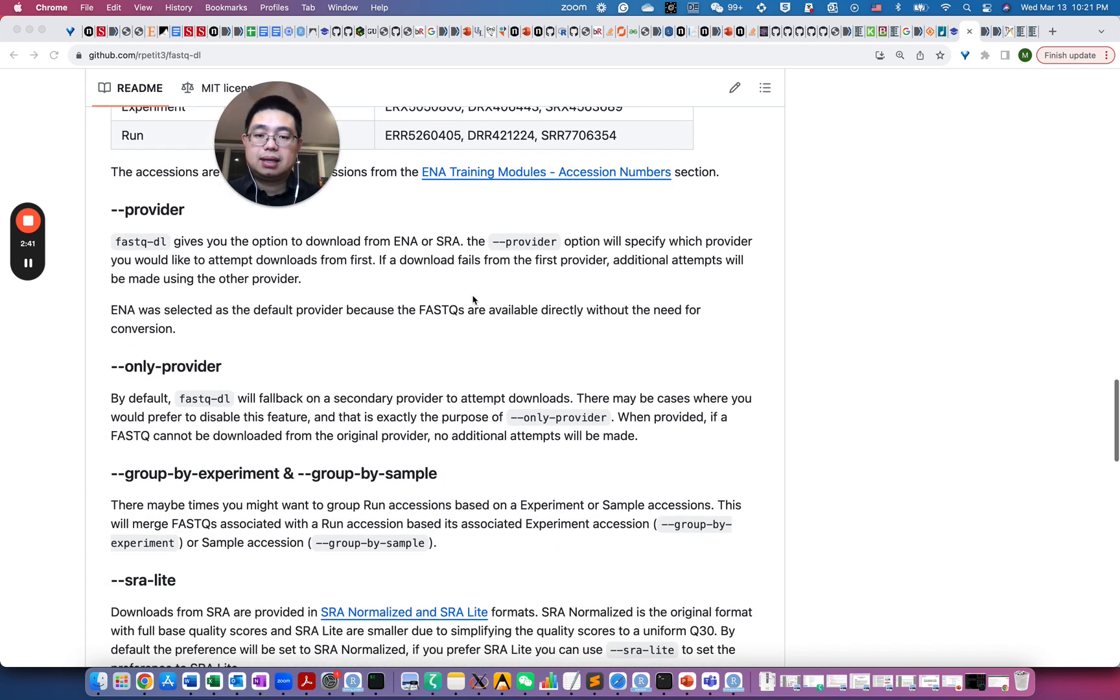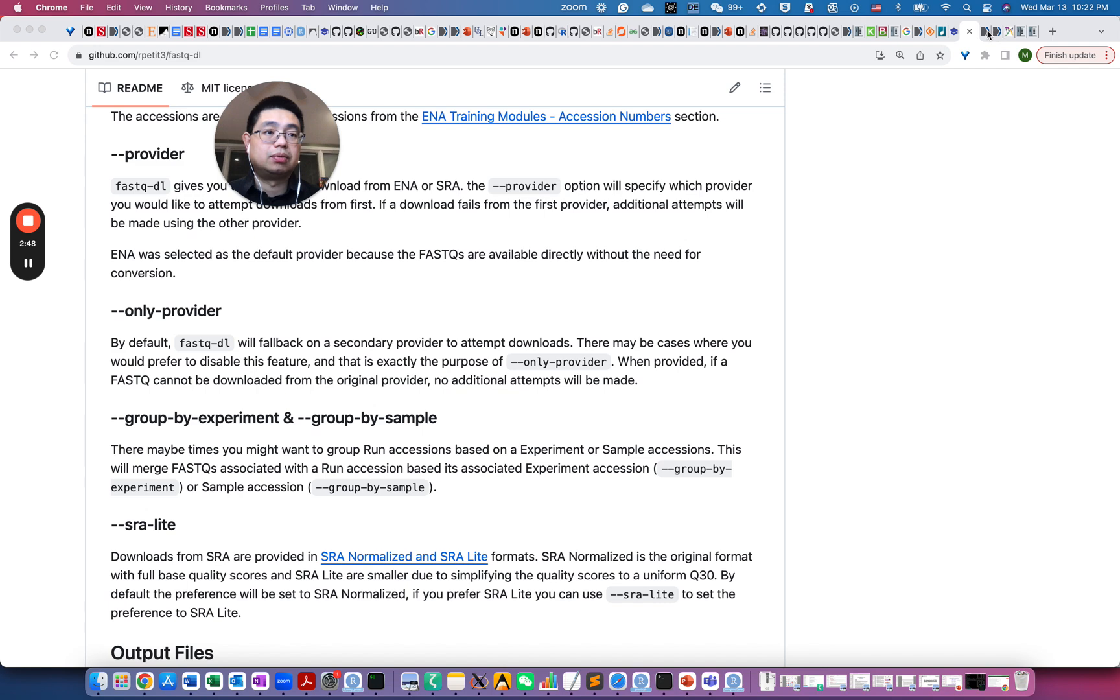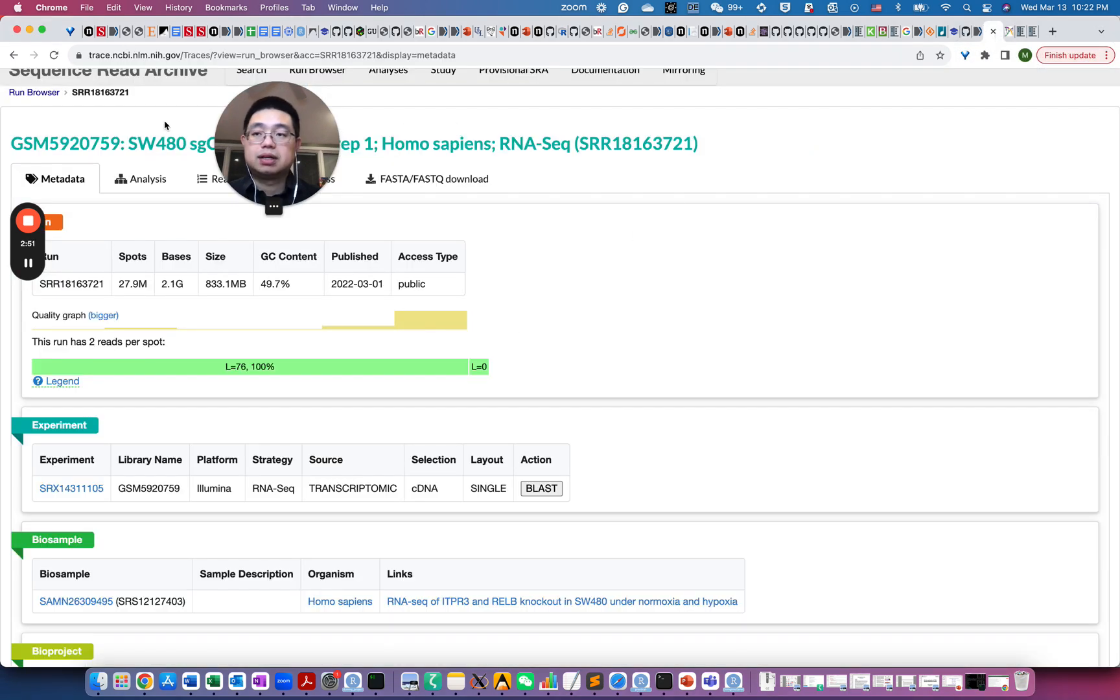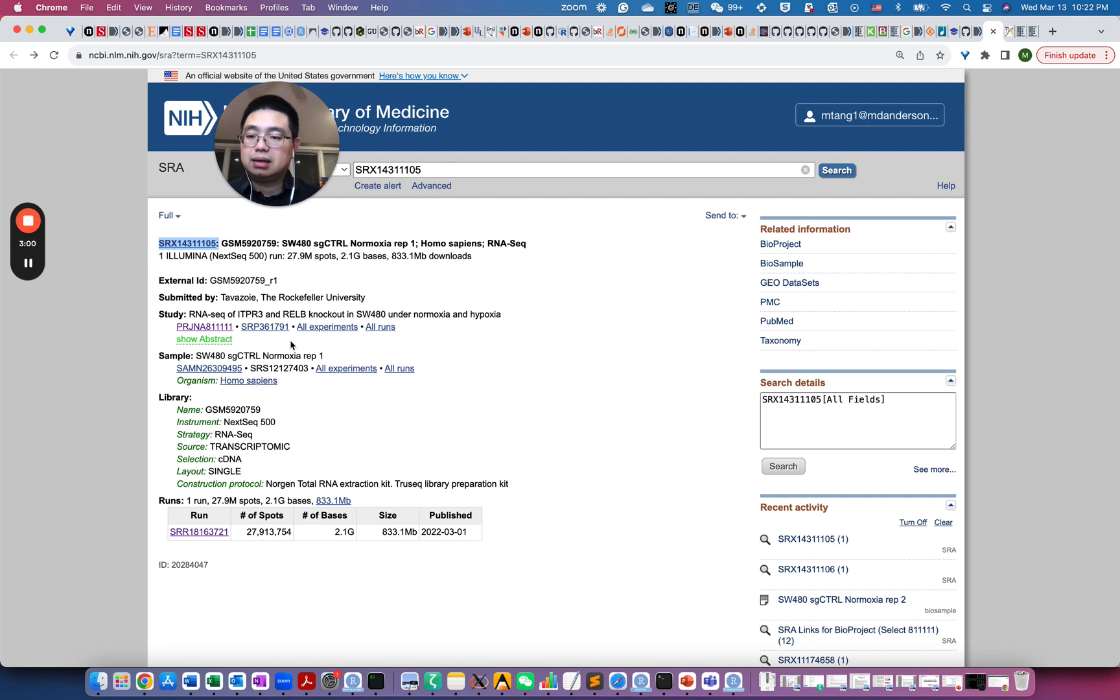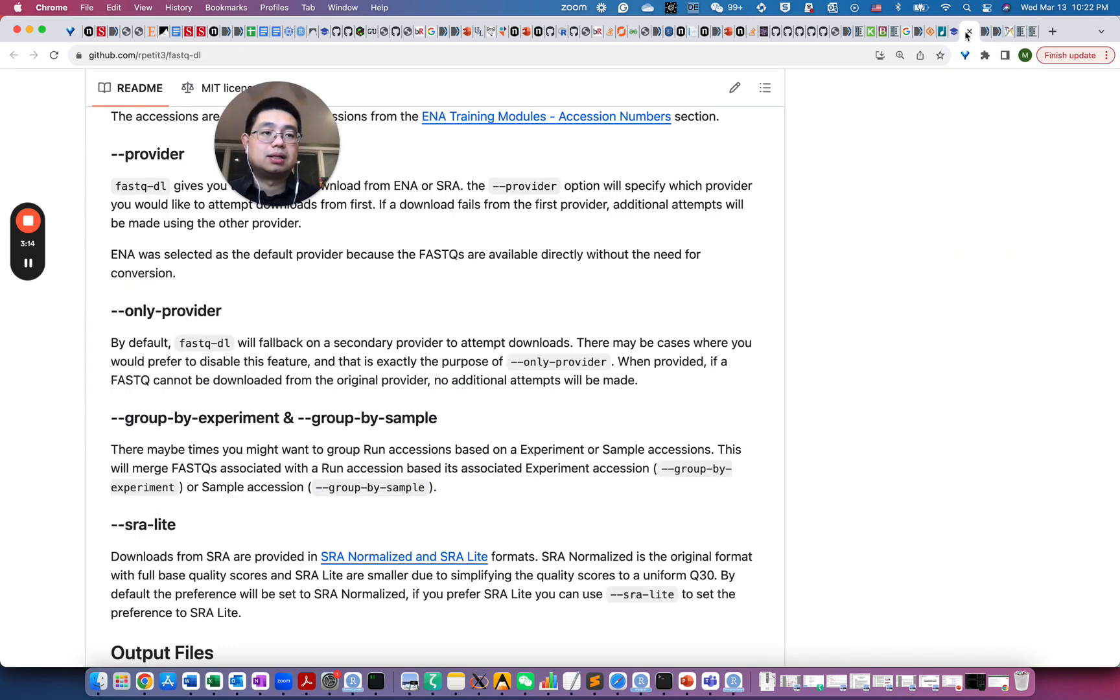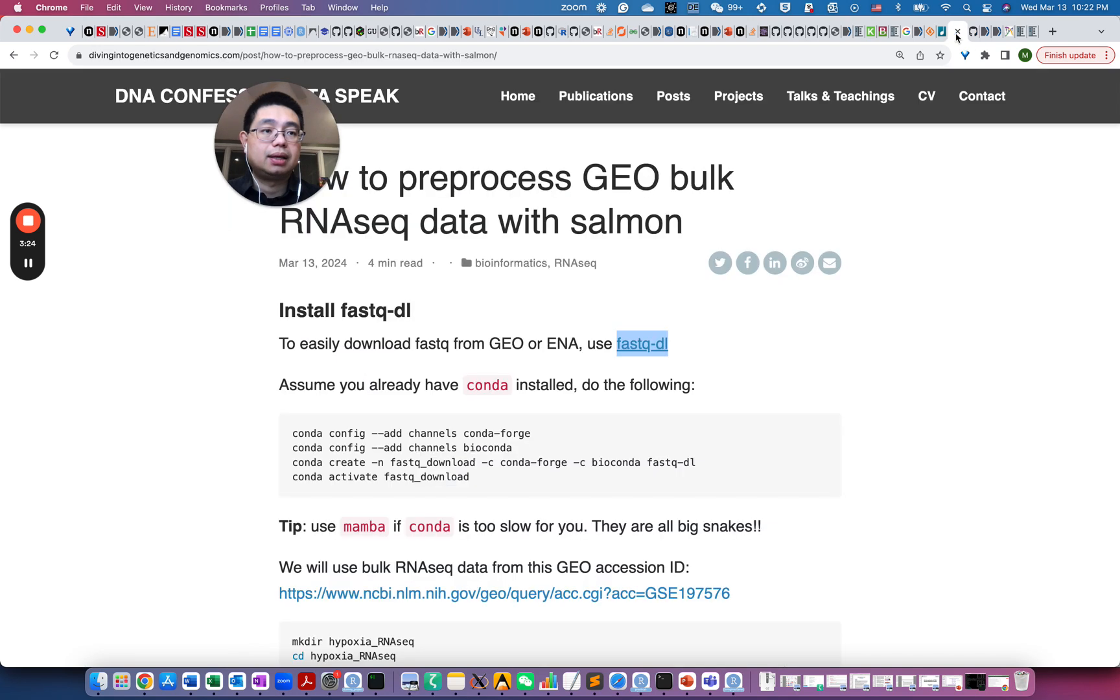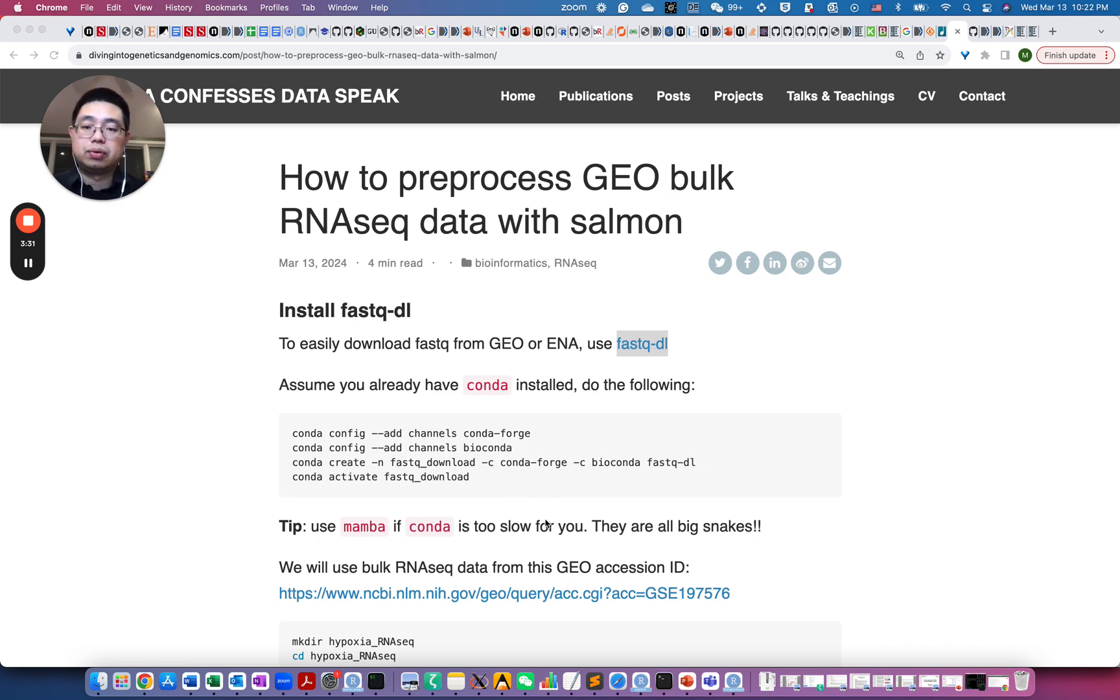So I actually really like one of the arguments called group by sample. So the reason I like it is because, for example, here, this is for that single sample here, the SRX, this is the experiment ID. And sometimes you actually have multiple SRR runs. So I have multiple SRR IDs for the same experiment. So what you can do actually, you can use that group by experiment argument will actually merge all those FASTQ files for you, which is very handy. Let's go back to the blog post here. So I will have the link of this post in the show notes.